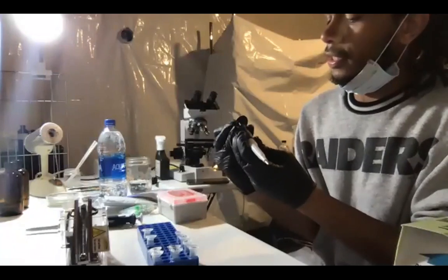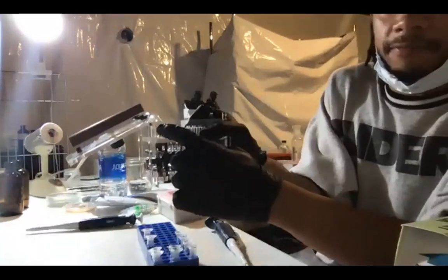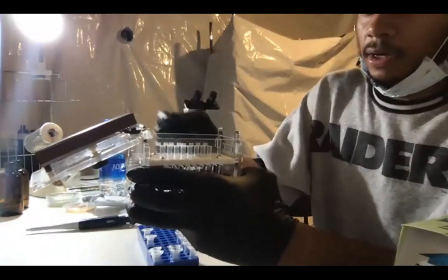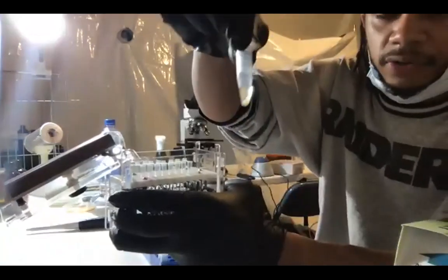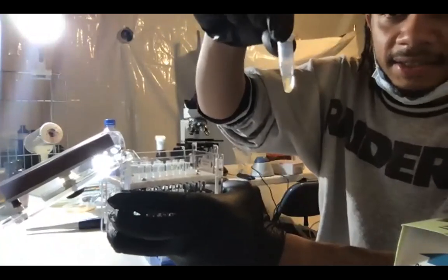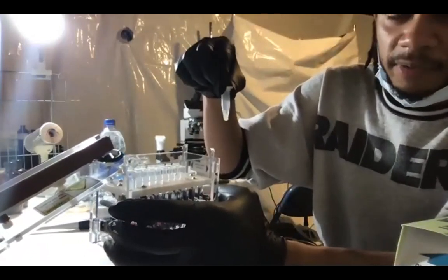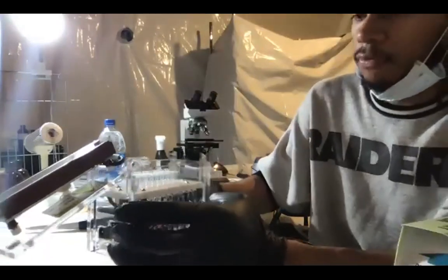So the way I organize this, just like I mentioned before, is that from the hinge, that's my number 1, and the one on the very end is my number 8. So number 1 and number 5 will be my first sample, MAT1 and MAT2. Number 1 will be my first sample with MAT1 primers. Number 5 will be my first sample with MAT2 primers. Number 2 will be my number 2 with MAT1 primers, and number 6 will be my number 2 with MAT2 primers. Number 3 will be my number 3, and so on and so forth.